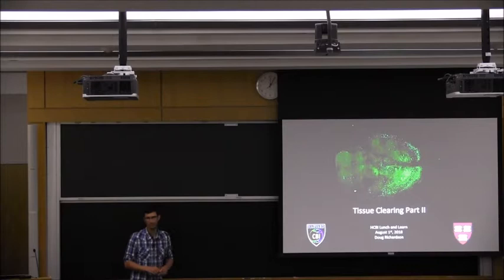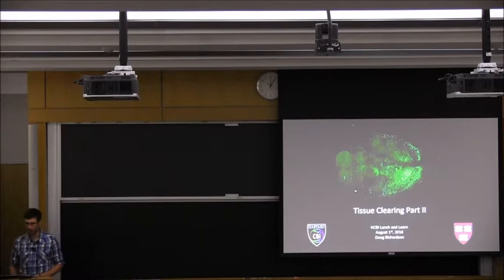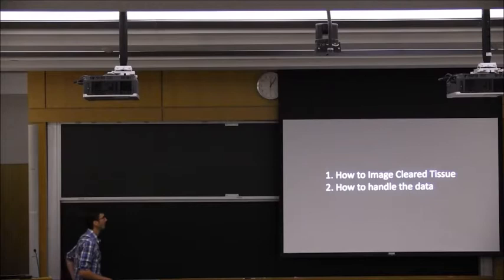Great. So today we're going to continue with tissue clearing. So today is part two. We had part one 2 weeks ago, where we talked a little about the different clearing techniques and how they work. And what I want to do today is move into how we actually manage these cleared tissues, and then what do we do with the data.